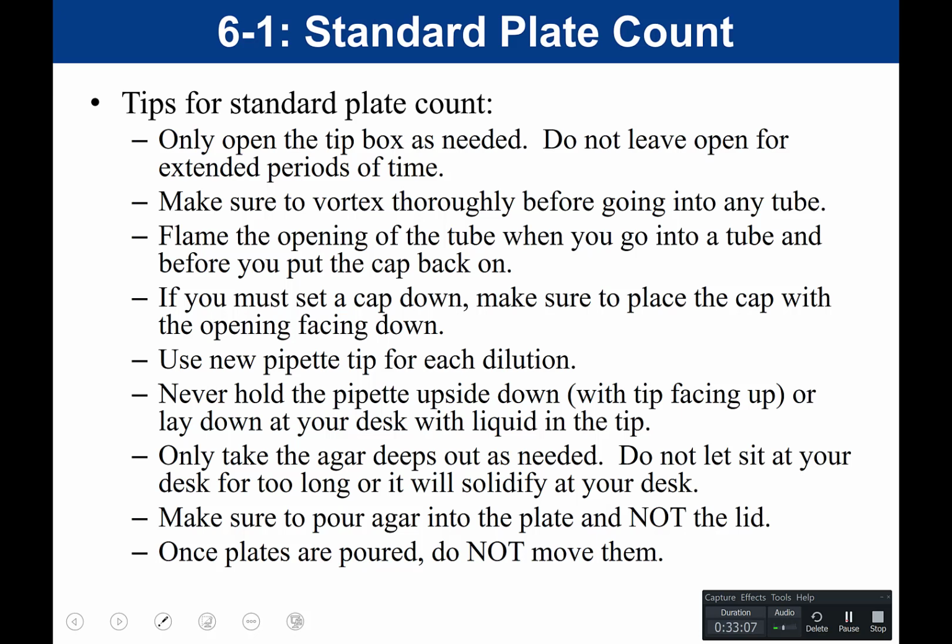And then lastly, once the plates are poured, do not move them. Again, if you try to move them once you've already poured them, the liquid is going to slosh around and it's either going to contaminate the desk, it's going to end up with bacteria in the lid, or your count is going to be inaccurate. And so it's important that you make sure and don't move your plates once they're poured.